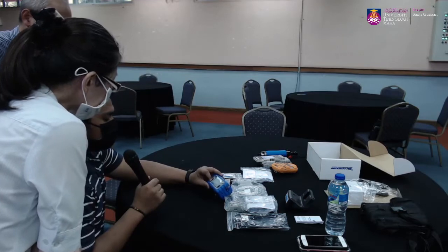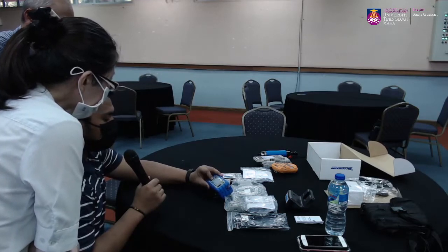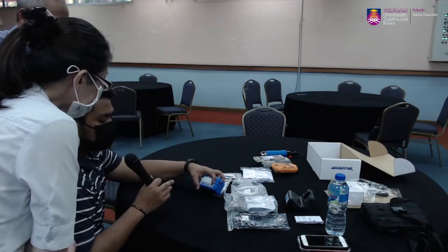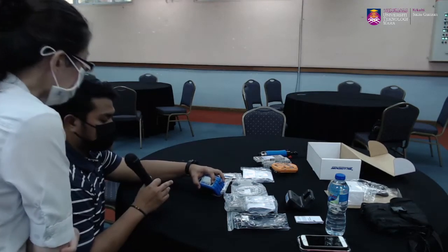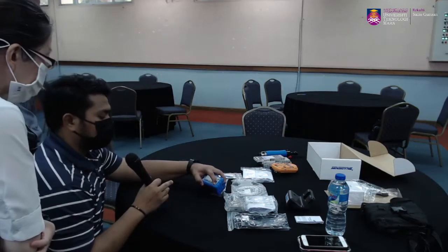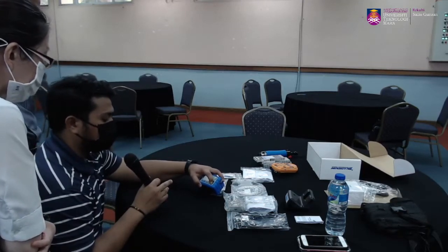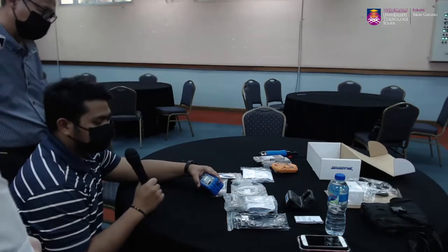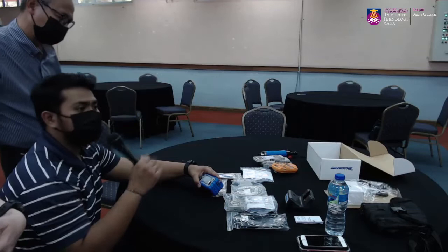Okay. So in terms of control mode dia is ada CF, constant pressure low, constant pressure high and also constant flow. So dia ada 3 lah. Tapi in terms of kita nak pakai tu kita kena identify kita punya flow rate and berapa media kita nak pakai lah.